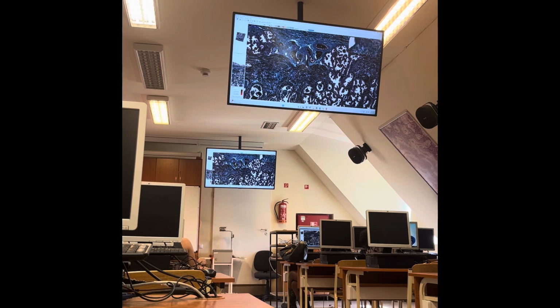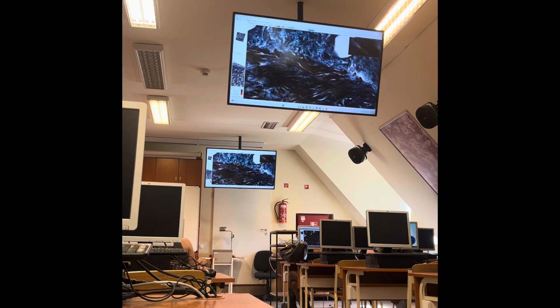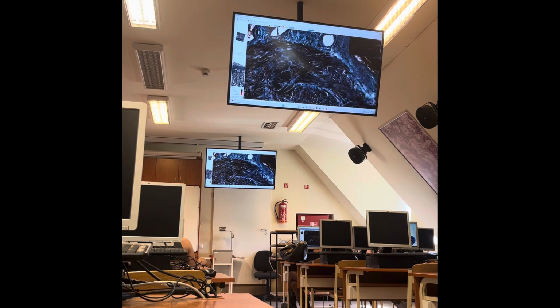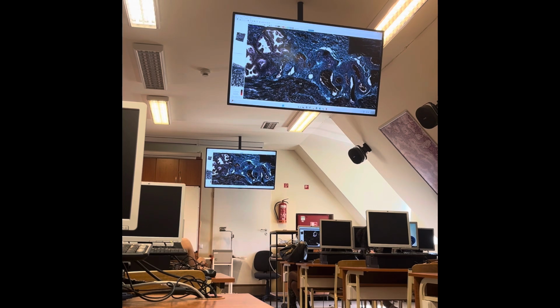So if you look at this portion of the specimen, you can see the smooth muscle cells at least partly in orange color, the nucleus is green, and you can more easily distinguish between the smooth muscle and the collagen fibers with the aid of this staining technique. Okay, so the fibromuscular stroma is the main point in the usage of this kind of staining. So connective tissue parts and smooth muscle components are easier to distinguish in this case.